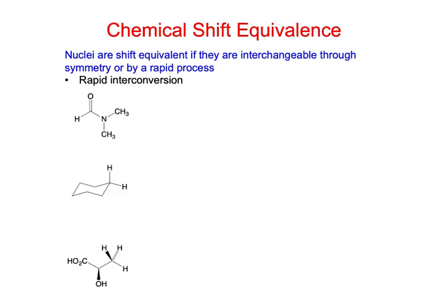So other places where it's important, let's look at these three molecules. In this case, this is just dimethylformamide, DMF, a common polar aprotic solvent. One of those that's not so easy to get rid of.